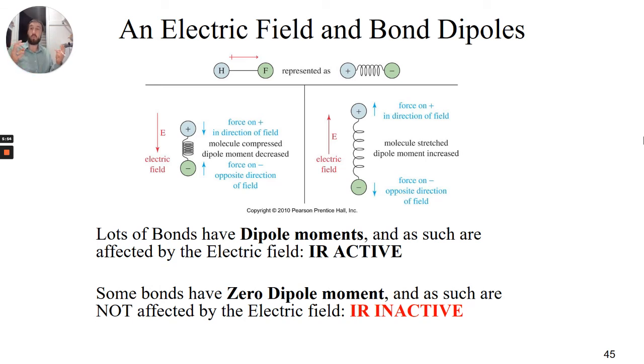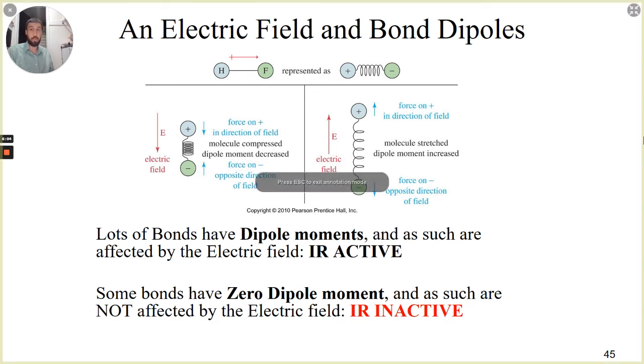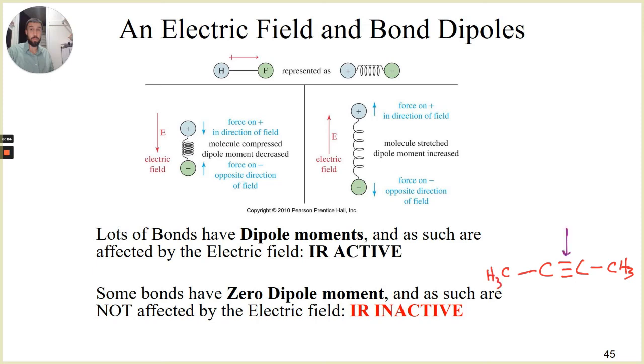The kind of trick one that typically shows up in some spectra would be the IR inactive one. Okay? And that's if you have a perfectly symmetric system. Symmetric typically only happens around the triple bond. And if we were to look at, that's a little too simple, let's make it a butyne. The triple bond disappears. Okay? It is inactive due to the perfectly symmetrical stretch of that structure. That signal disappears from the IR.